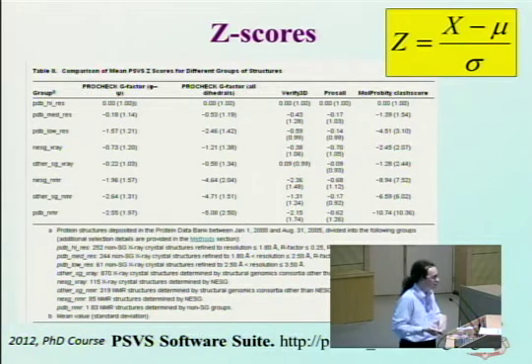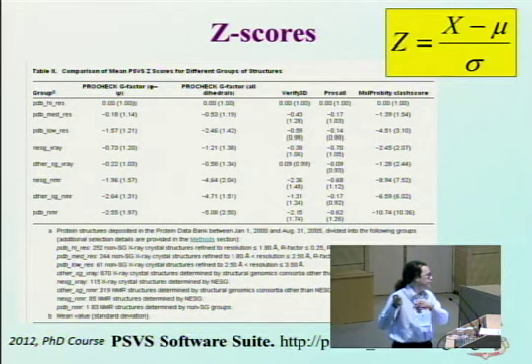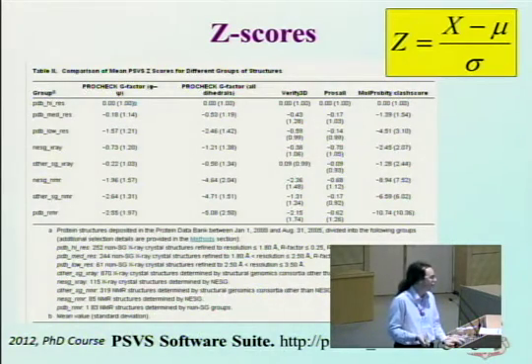And you know that if you are 1 sigma away, it's slightly over 60% chance to be there by chance. And if you are 3 sigma away, it's 99.9% that it is a mistake, let's put it this way. Of course, it doesn't tell you it's a mistake. It just tells you this is strange with respect to this distribution, so in principle you should go there and double check why this has occurred.